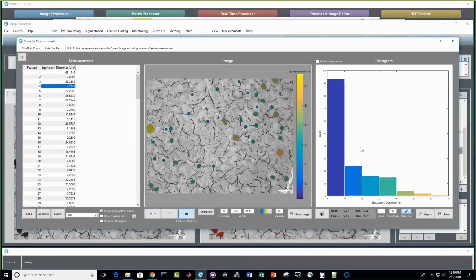We do have curve fitting on the roadmap. Very shortly you will be able to curve fit a function of your choosing to, or have MIPAR decide the best one, to your histogram, since we realize that is an activity that many folks like to do, and it would be convenient for them to be able to do that directly in MIPAR. But at the moment I can't think of any fitting that's done to distributions prior to statistics being calculated. The stats always just come from the raw measurement data.